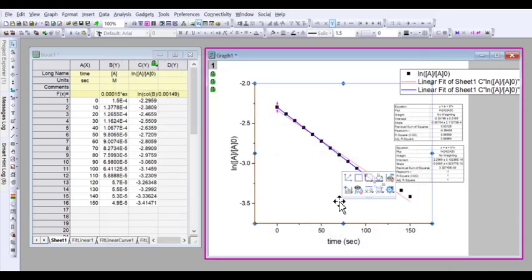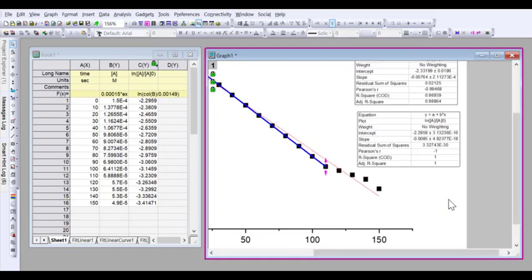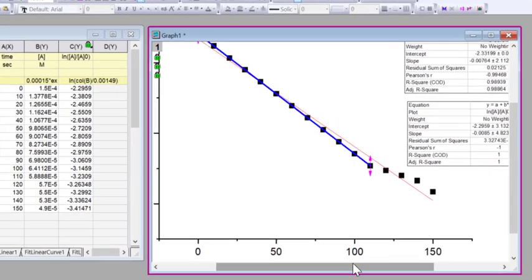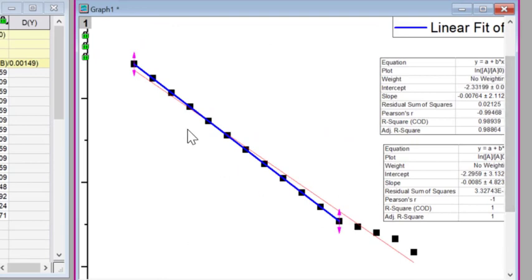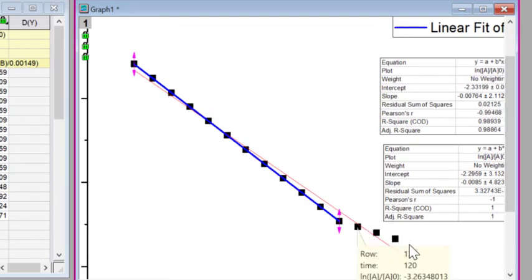What we can see is this second line is slightly steeper than the first because it's not being skewed away by these final few points.